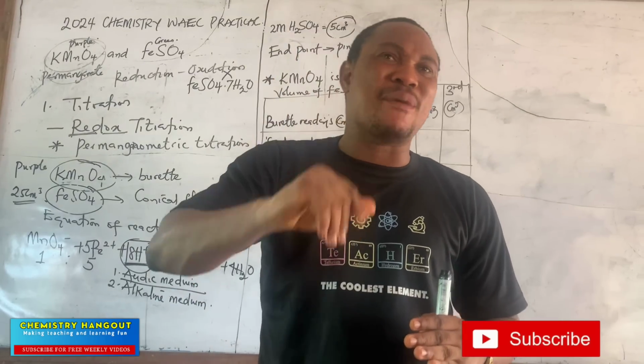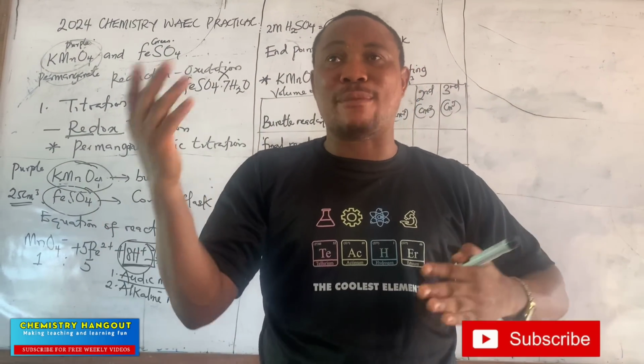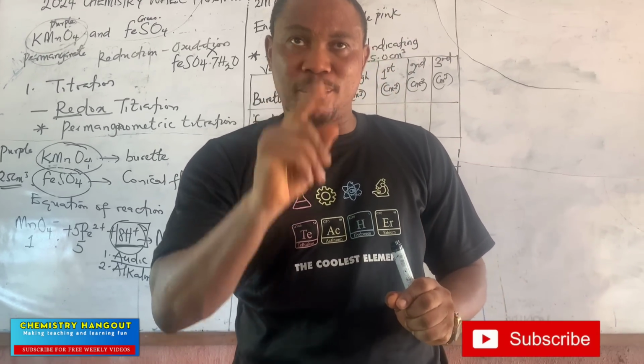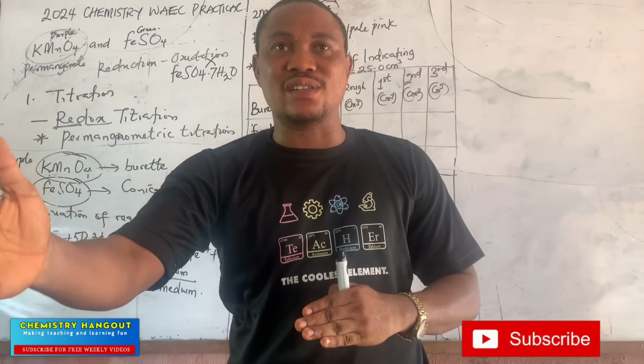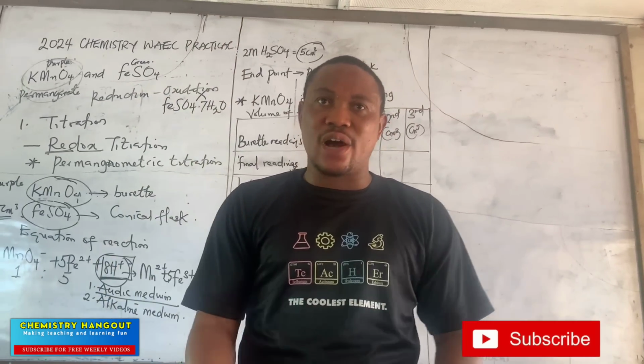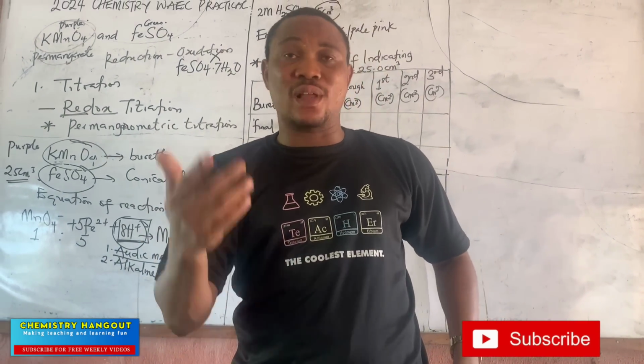I'm saying this and I'm emphasizing it. Know the titre value they are using there. Probably the teacher might be lenient and tell you the range of the titre value. Very important. Or you are asked to carry out the titration yourself. So we are going to be doing two things. We still carry out the titration here on the channel to get our own titre value, so that you see how you will do it on that day.